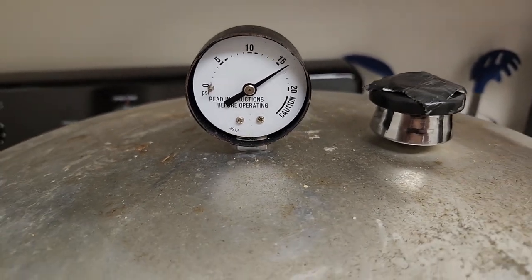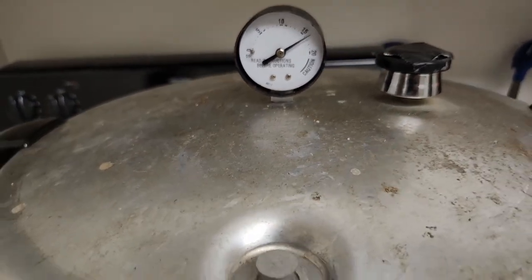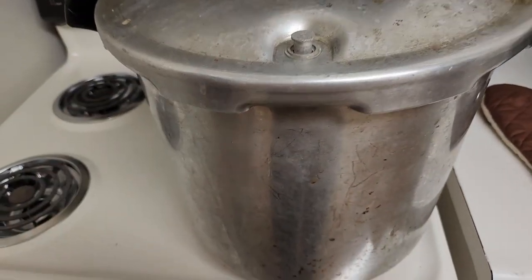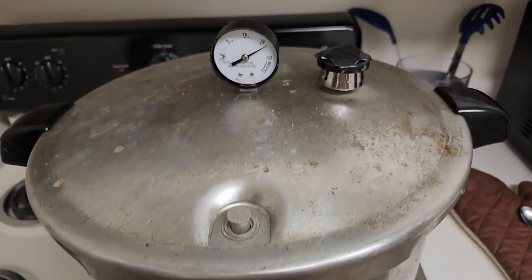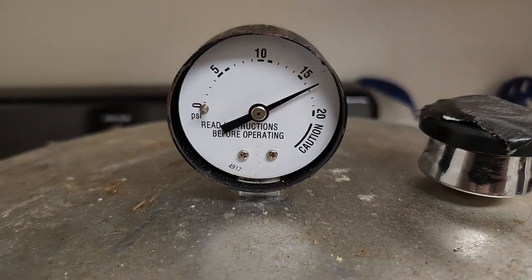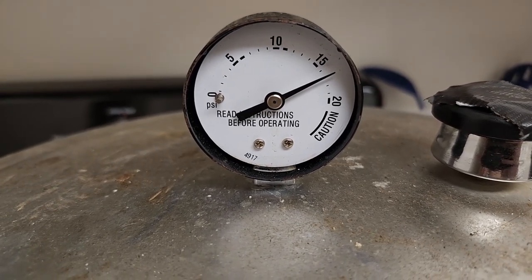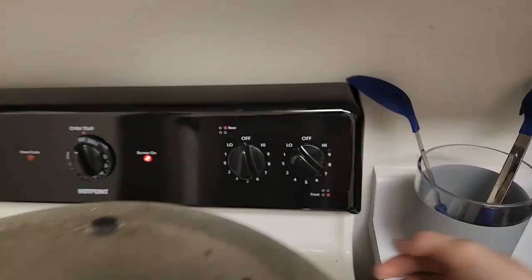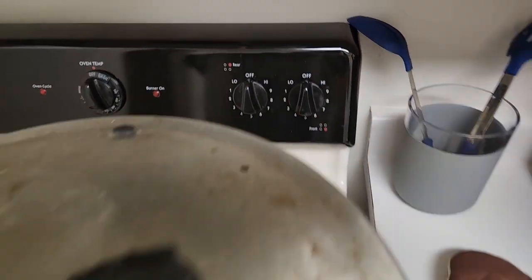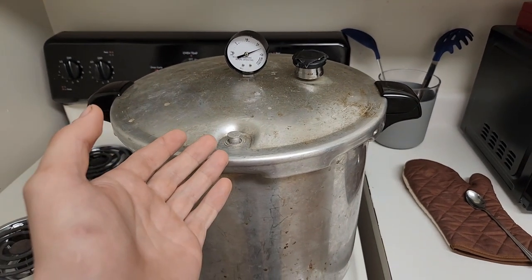All right, we're starting up to get to 17, which means that this is done. Gonna go ahead and just let it get that last little bit up there. And we're good. Now I'll show you how to pour your agar.